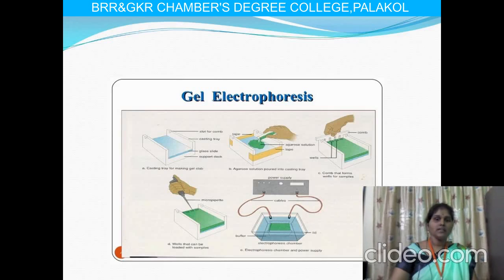So we have to place the agarose in place without any disturbances. After solidifying, we have to take the comb, and observe this third picture. The comb is almost always made of plastic. This comb is inserted into the gel, and in that gel the comb makes wells.